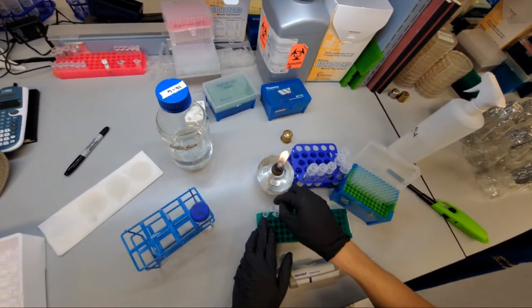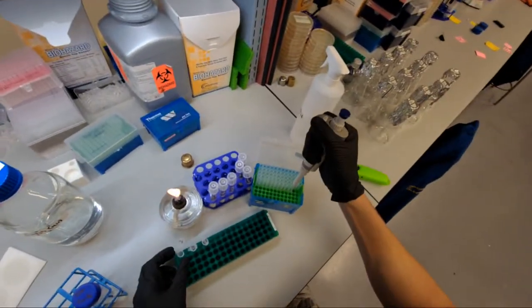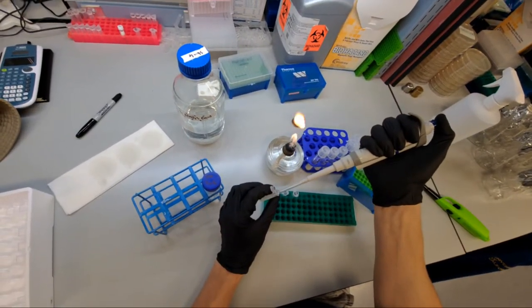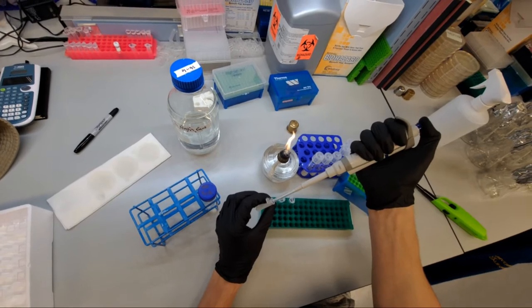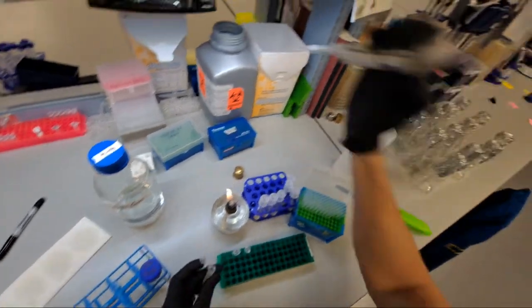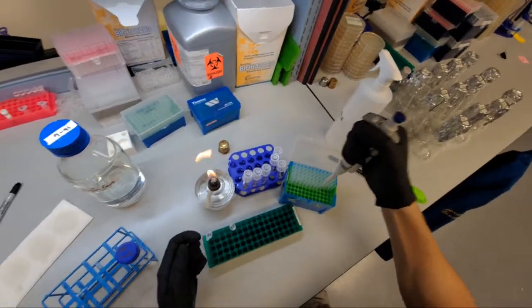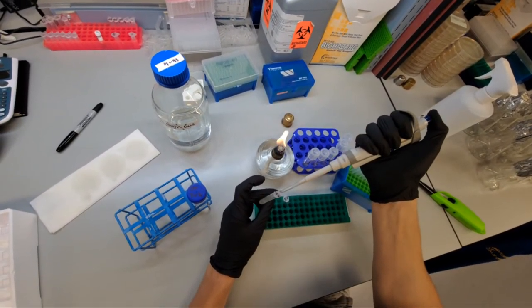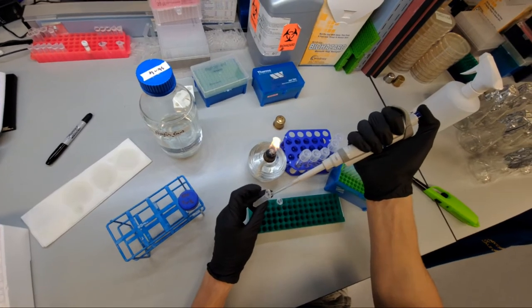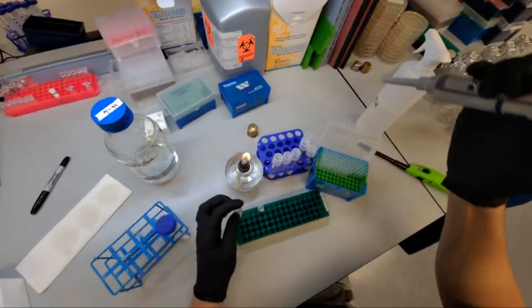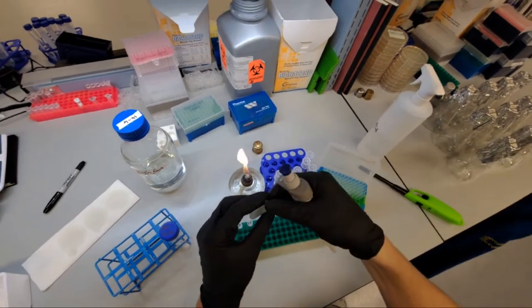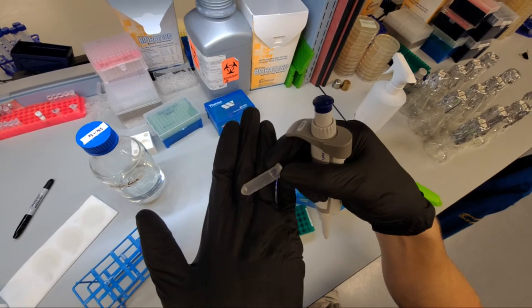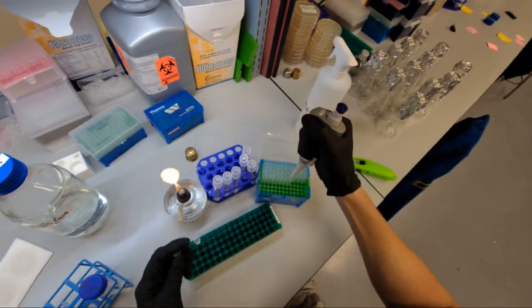So we'll take these and I want to mix the cells around actually. I could do it with a vortexer. If I had more tubes, I would use the vortexer, but I'm too lazy to stand up. So I'm just going to pipette up and down. I'll try to show you the pellet in this last sample. See the little pellet right there. I'm just going to pipette that up and down to mix that around.